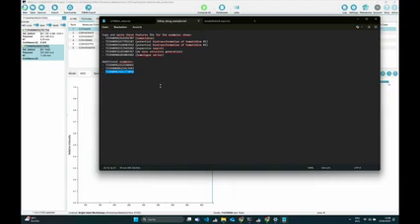Okay. So the first question: in our work we are also looking at environmental contaminants. It's pretty common that we have, for example, chlorinated compounds, with more than one chlorine. I was wondering if you have any recommendations in terms of the selection of the elements. For chlorine, is it better to just leave it on auto-detect, or should I include it in the elements? Is there a difference at all?